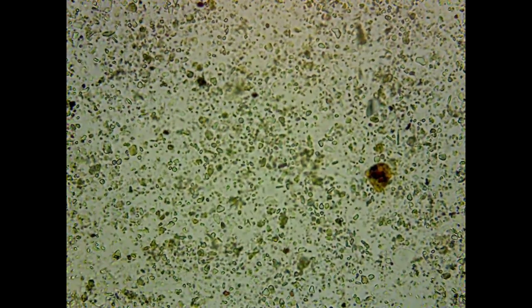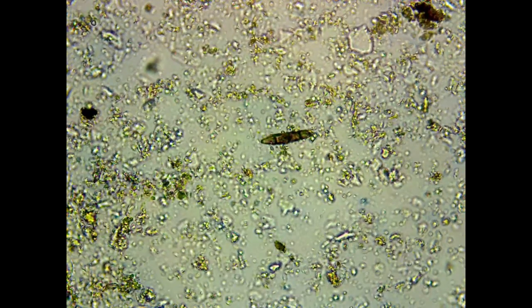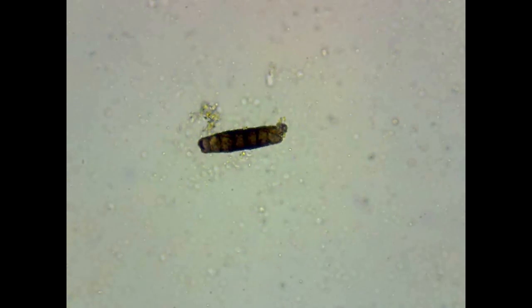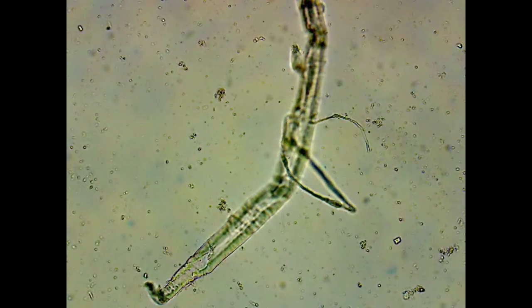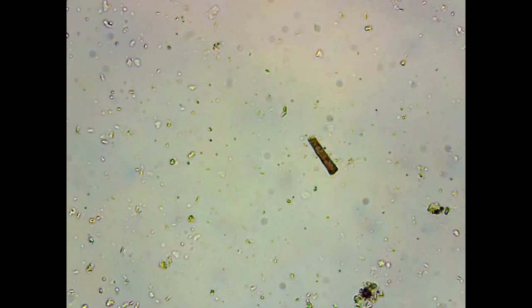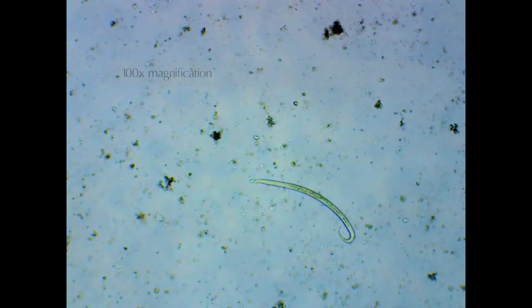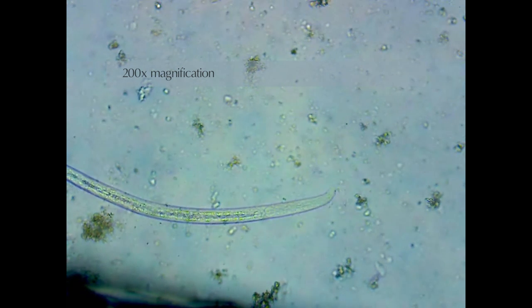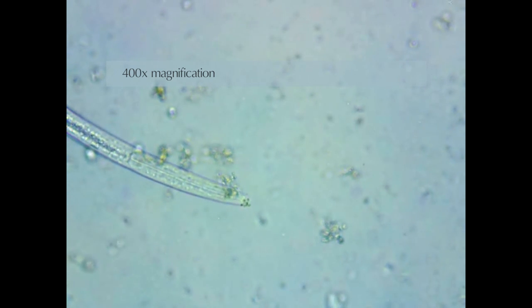Here are a few images taken from a sample in the grass buffer. For a variety of reasons, it is not uncommon for grassland and woodland areas to have increased nematode populations, which makes it not surprising that we found a nematode in this sample.